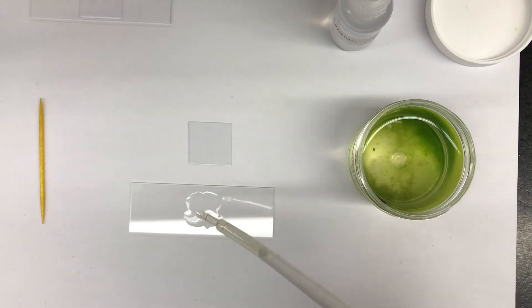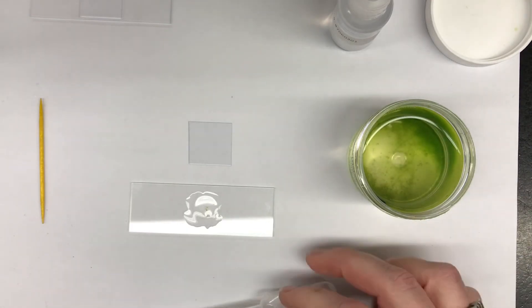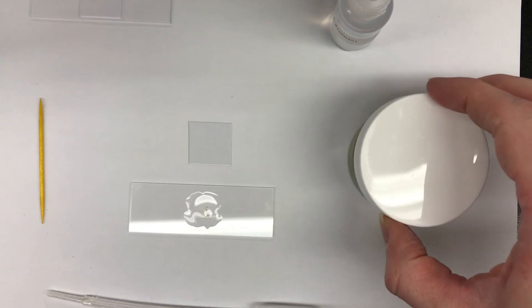You're going to place one drop directly in the center of where you put the protosloe. Put the lid back on the jar.